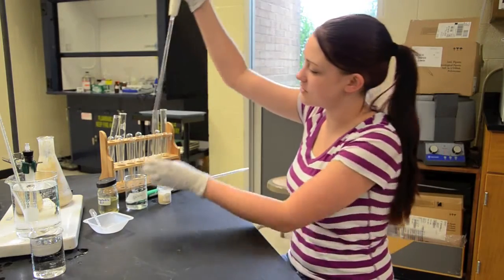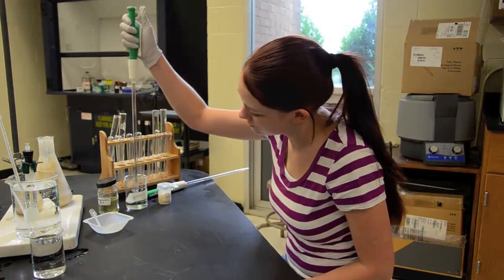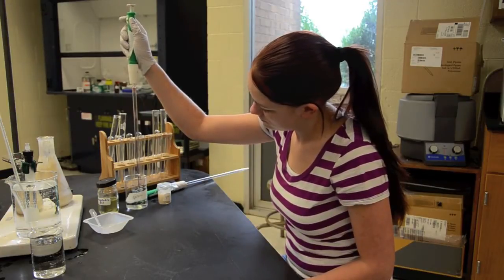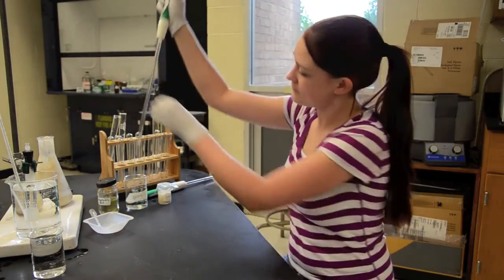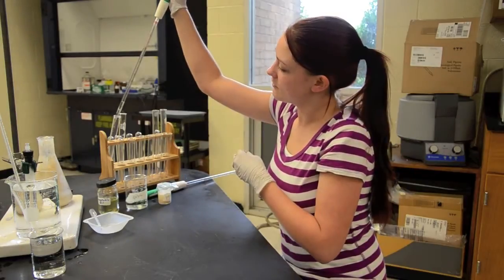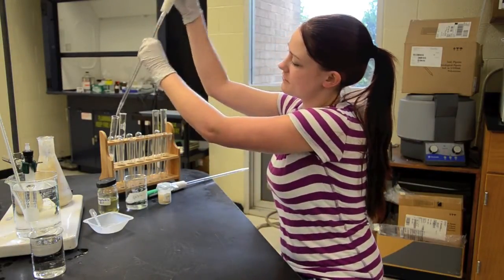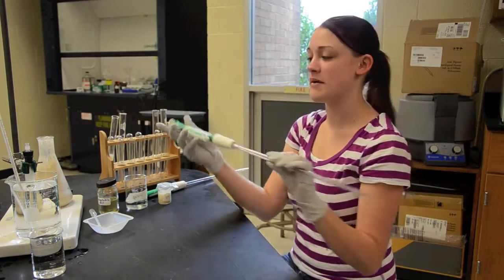We're going to add our glucose. It's two and a half mls of glucose. Add it to the test tube. That's a dedicated pipette labeled glucose.